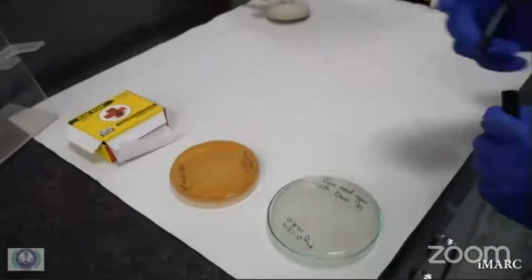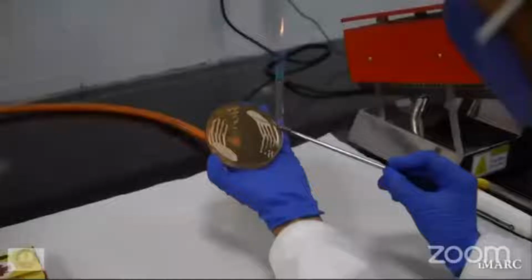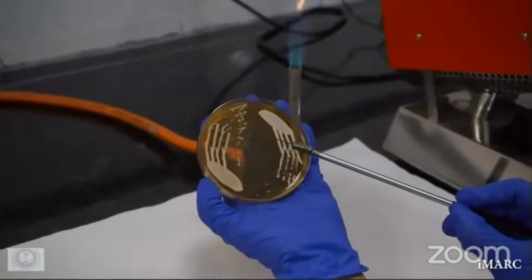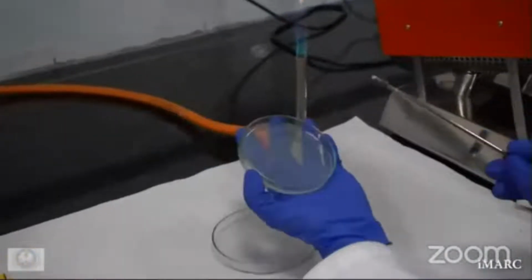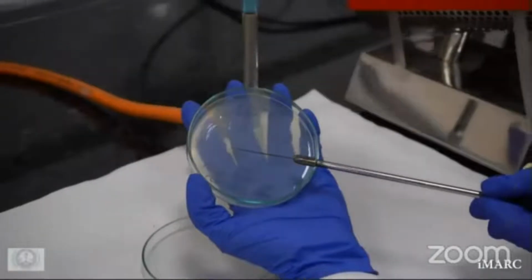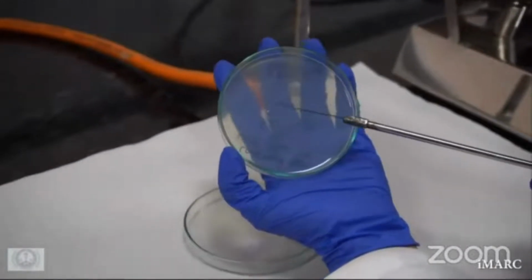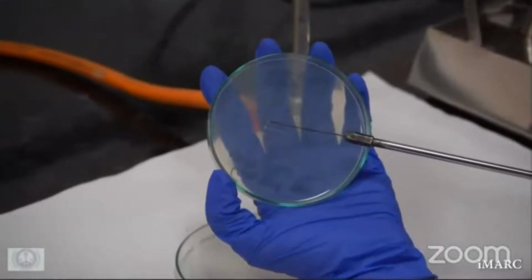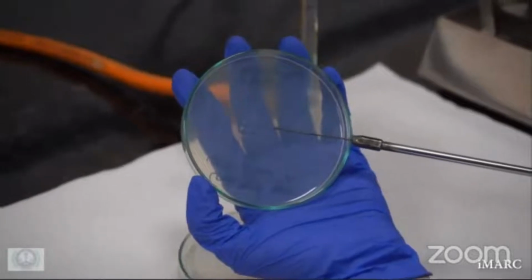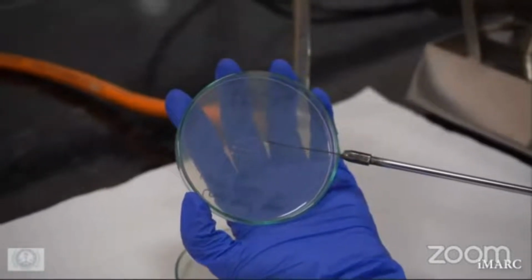meal agar containing 1% Tween 80, usually in a 90 mm plate. We divide the plate into 4 quadrants and label each quadrant. Using a sterile needle or straight wire, lightly touch the yeast colony and then make 2 to 3 streaks. Place a flame sterilized and cooled 22 mm square cover glass over the central part of the streak.